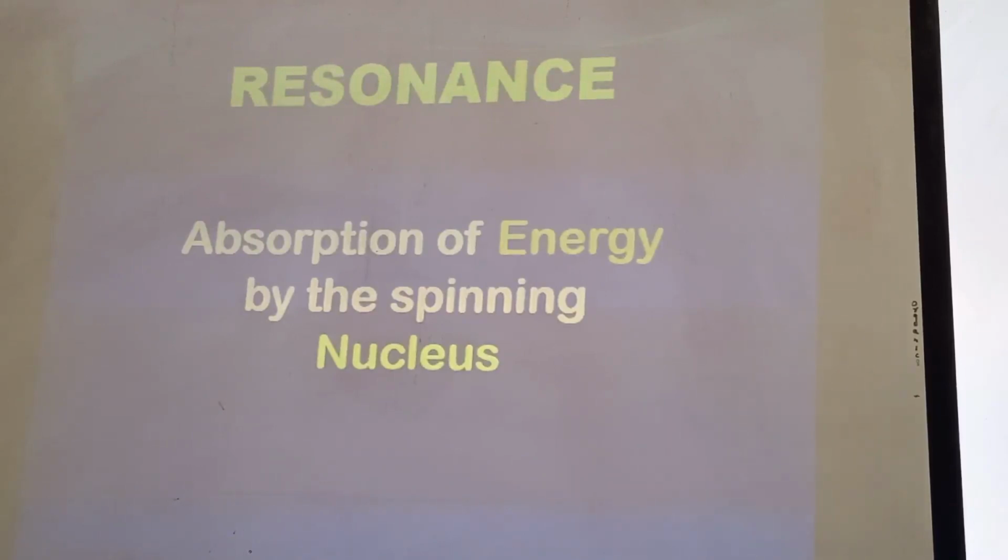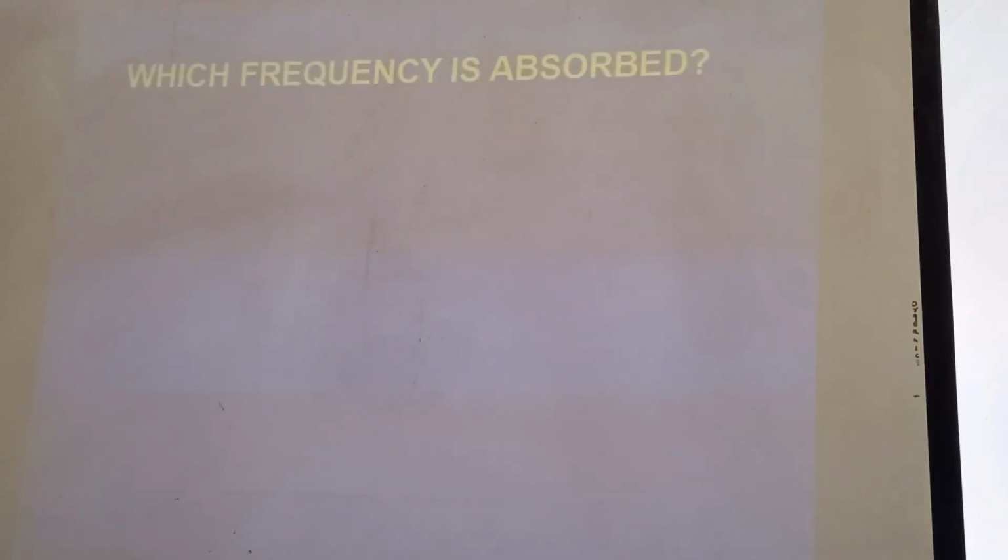Resonance means the absorption of energy. Which energy? This energy is in the form of radio frequency. You are providing radio frequency, and that radiation has a particular frequency.